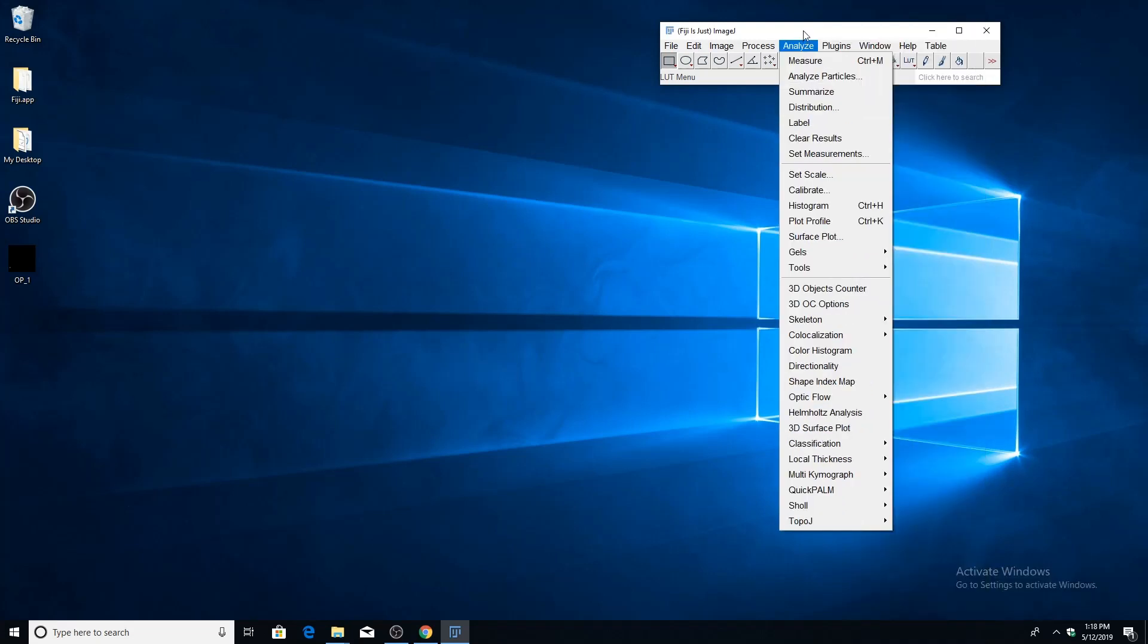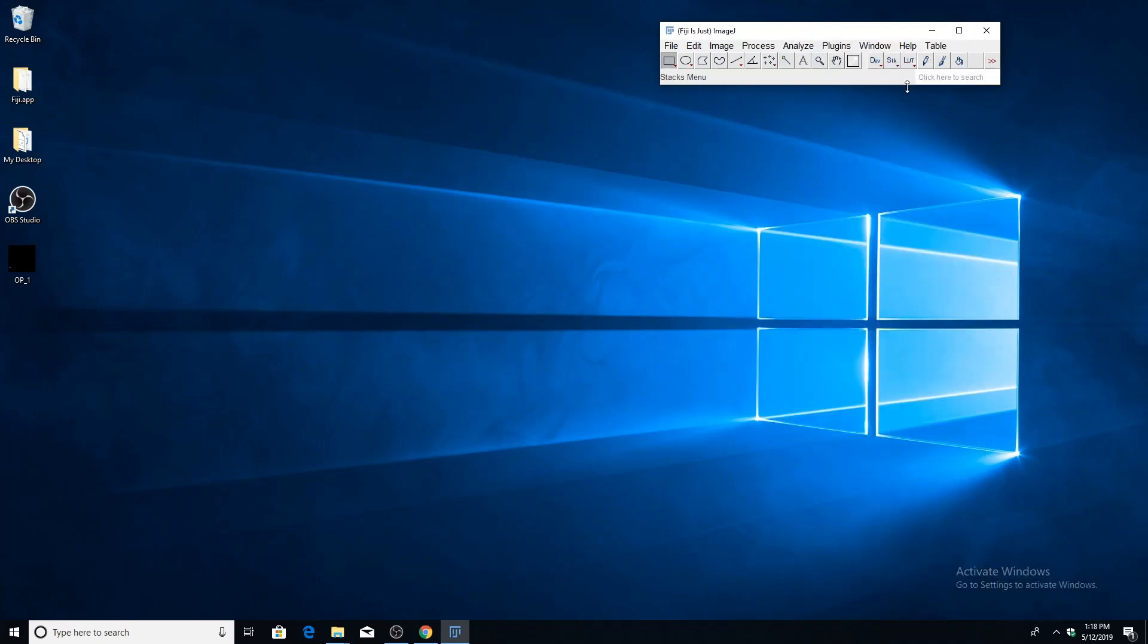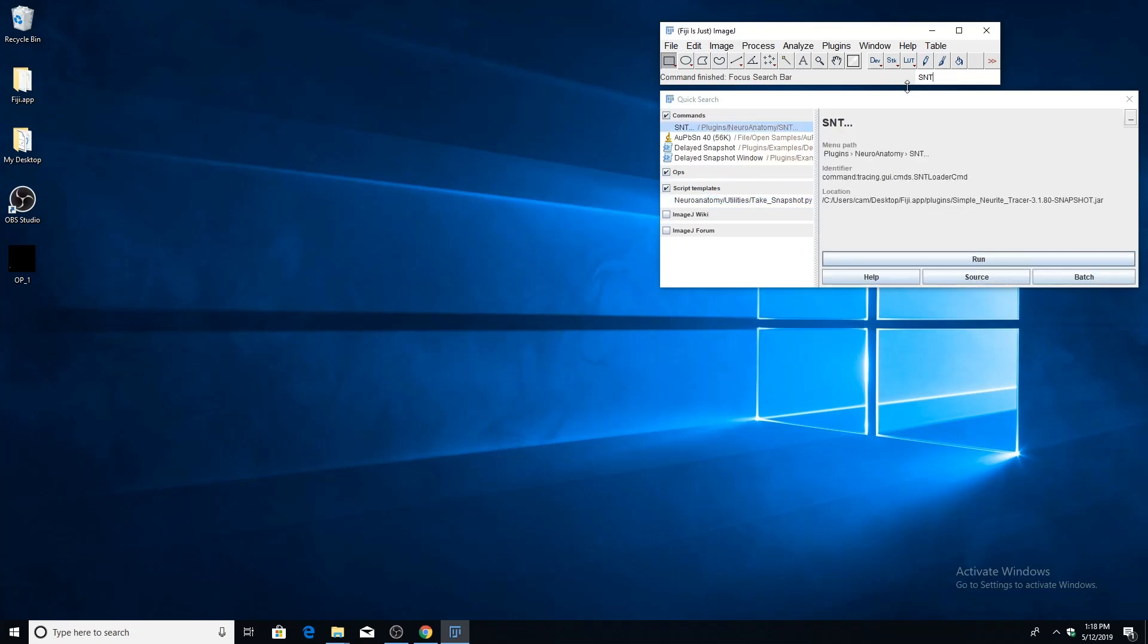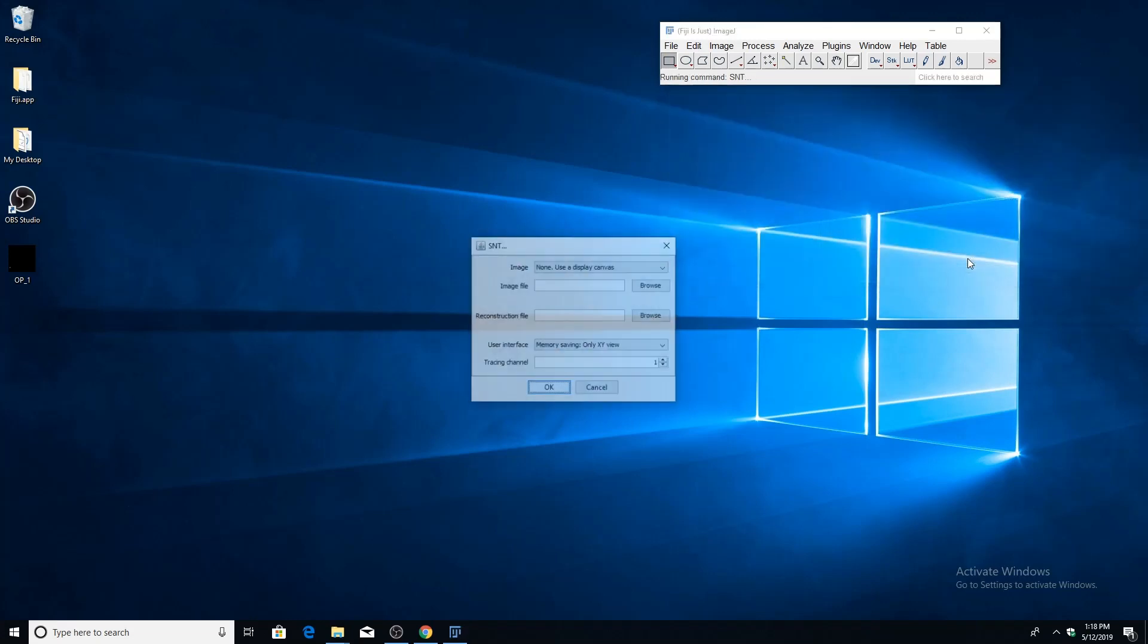Alternatively, if you don't want to go through the menu structure, you can simply press the L key, which will bring up the command finder, and then just type in SNT and click run.